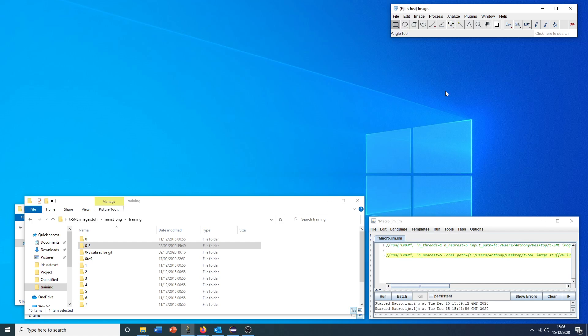This plugin takes as input either a stack of open images or a folder of images, upon which it applies one of three standard dimensionality reduction techniques, including PCA, TSNE, or UMAP.